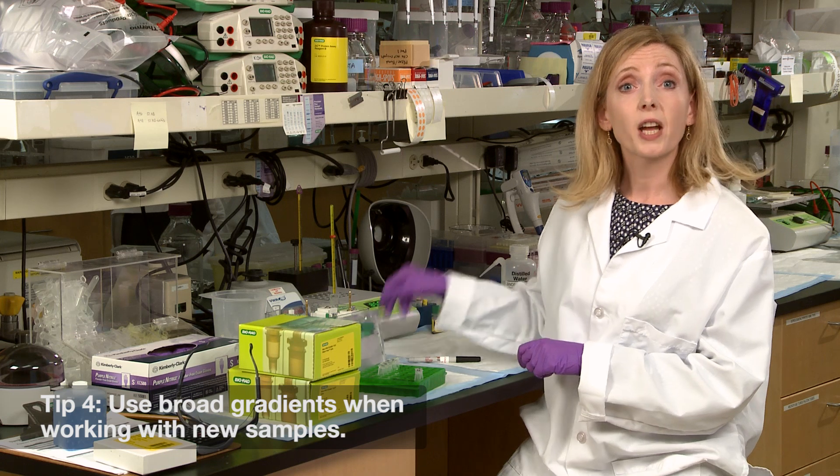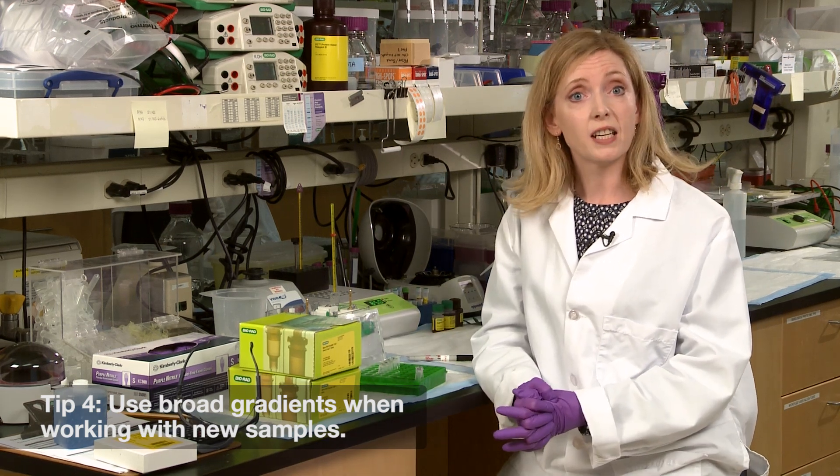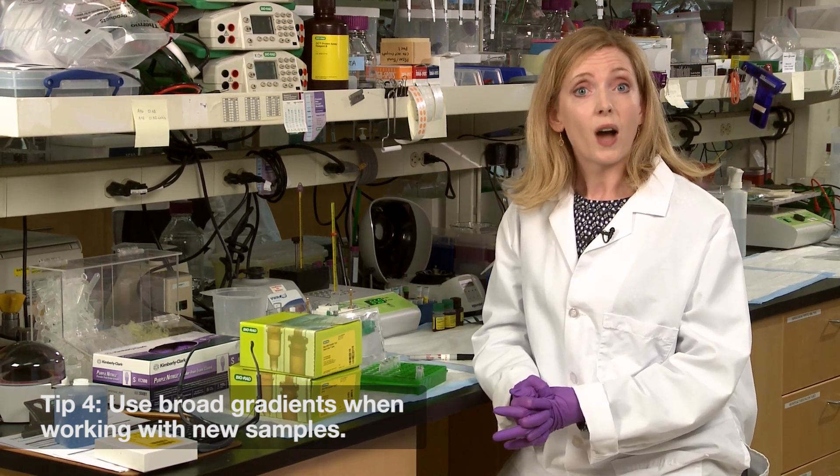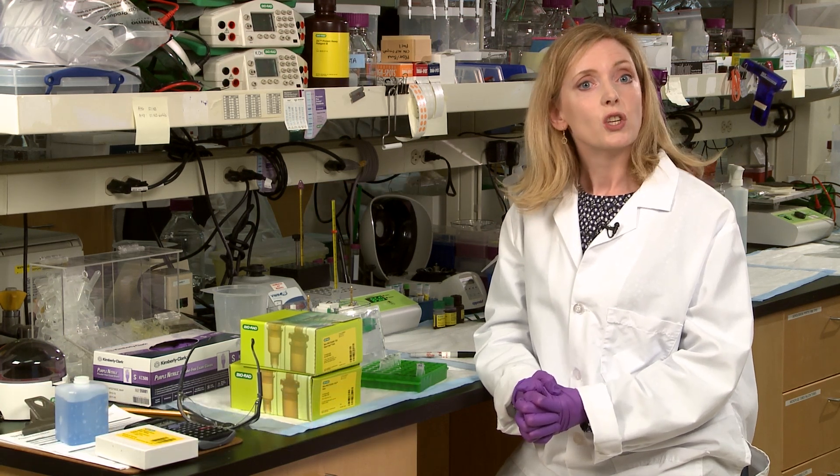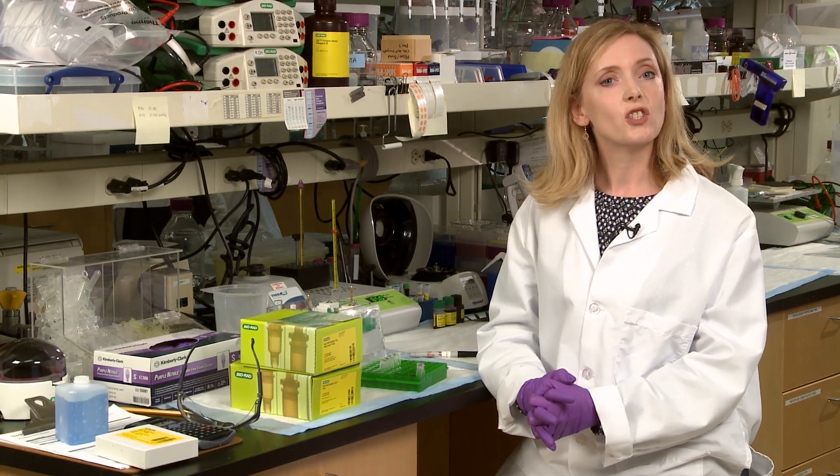Number four, if you're working with a new sample, use a broad gradient like 4 to 20 or 8 to 16 percent for a global view. Once you've determined the size of your protein of interest, you can move to the appropriate single percentage gel.